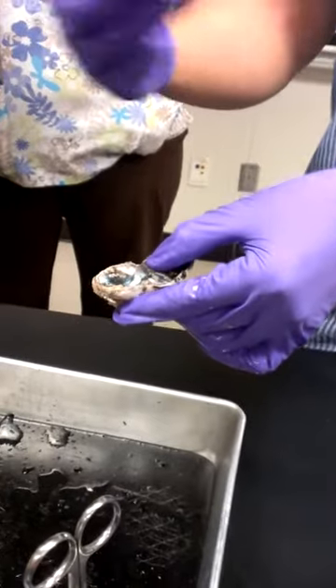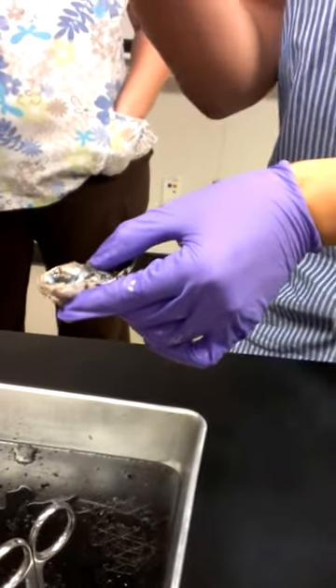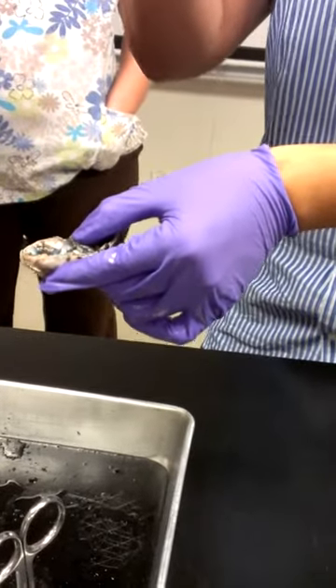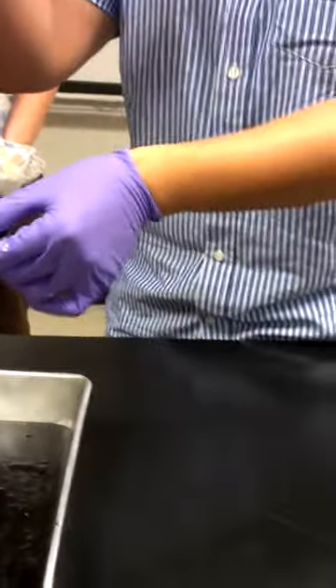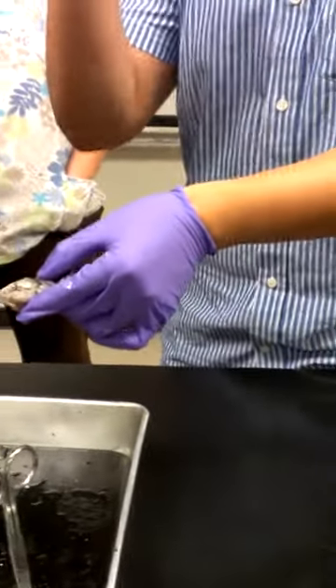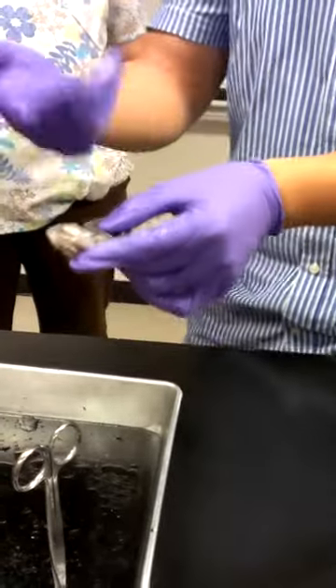The tapetum lucidum is found in animals only — only animal eyes — because they have that extra night vision, that little sheen. When you look at the eyes of a dog or a cat at night, or take a picture of it, you see that glare. That's basically this reflection of that membrane. We don't have that.